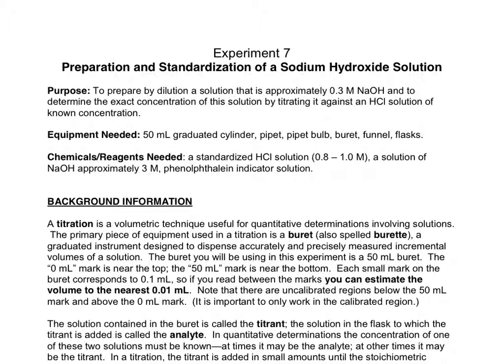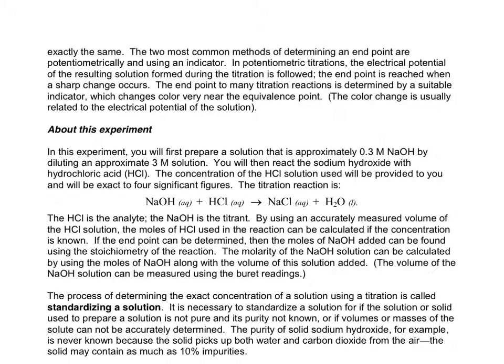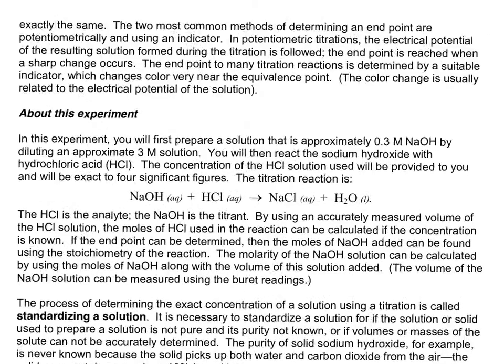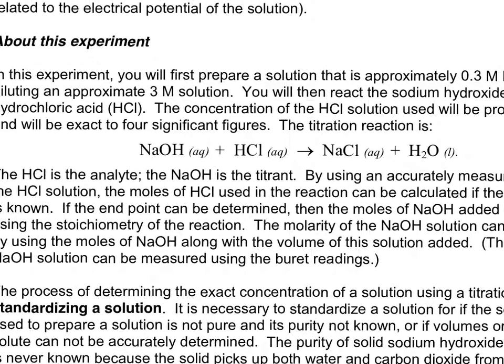Alrighty? Okay, so today's reaction is one that we've been talking about, I should say the phenomenon we've been talking about in lecture. I don't think we've looked at the whole NaOH reacting with HCl, okay? But that's what you're going to be doing. If you end up writing your semi-formal lab report because you don't have the calculations to give me when you come take your test, this equation needs to be in your write-up. Basically, I'll write underneath the two reactants, your sodium hydroxide, that's NaOH, and your hydrochloric acid, that's HCl.